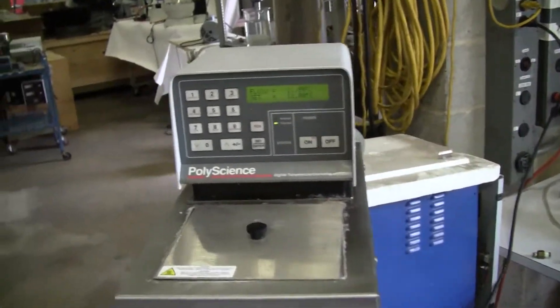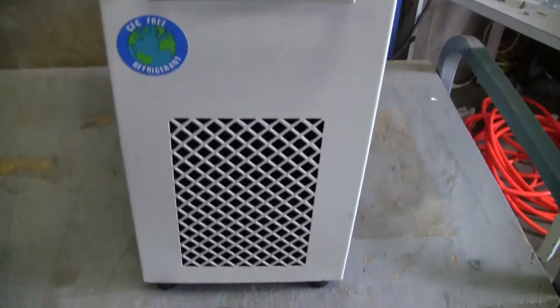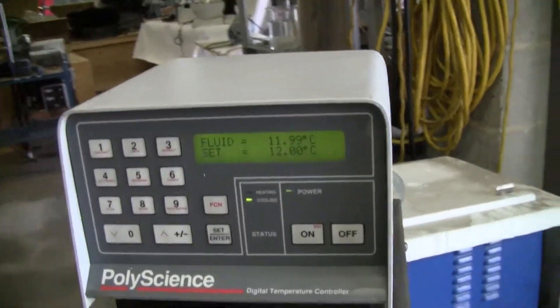Hi, this is Michael from Hitech Trader. Today we're looking at a Polish Science chiller. This is your standard 6 liter. It's got the programmable head, which is very nice.